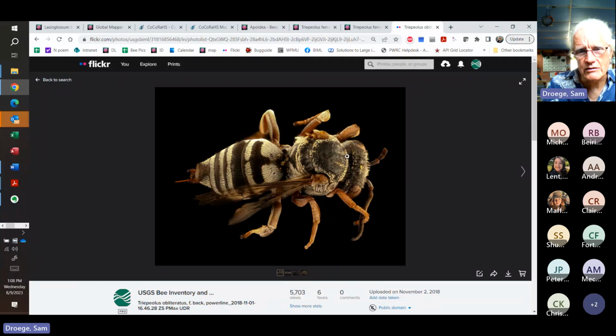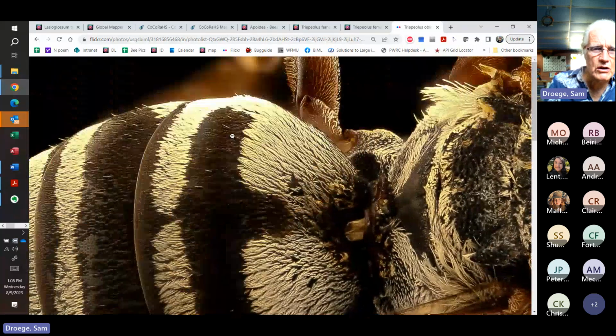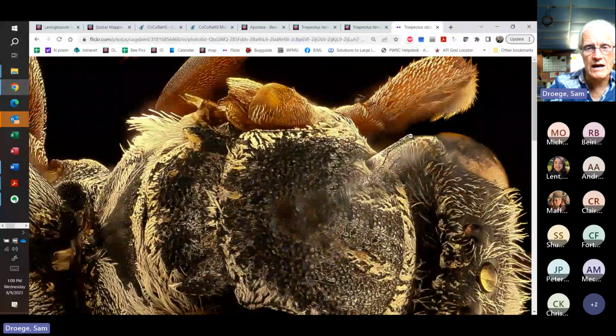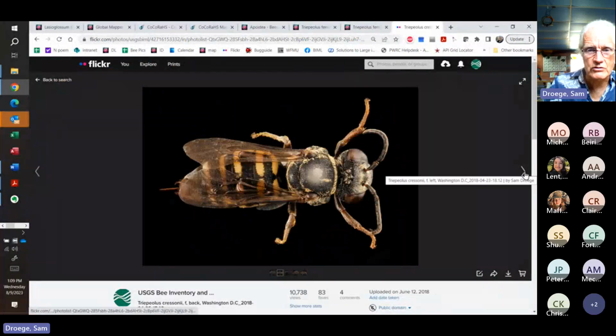So if we look at these kinds of things, this is a little ragged and rough here, but these are the kinds of hairs that we're looking at, which are very small, fat, in that they're wide because if you actually looked even closer, you'd see that they're branched in many ways, and they're lying down on the integument, and they form these lovely bandings of hair. So just the vibe from these will tell you that you're looking at Triepeolus.